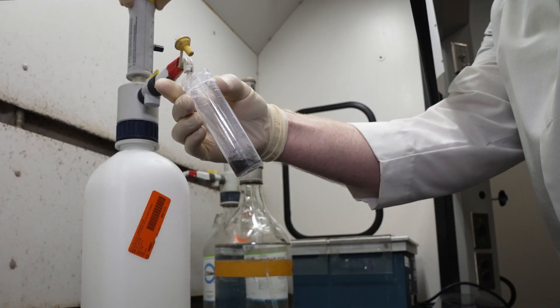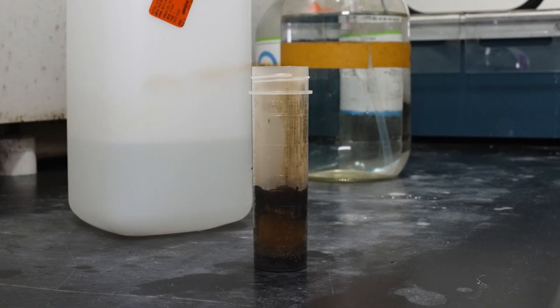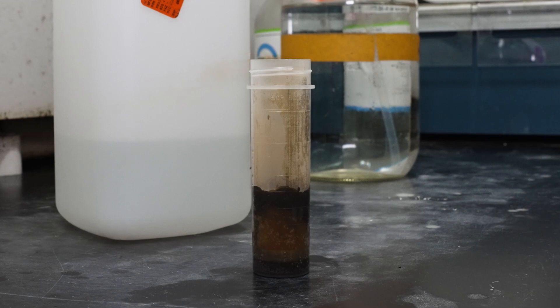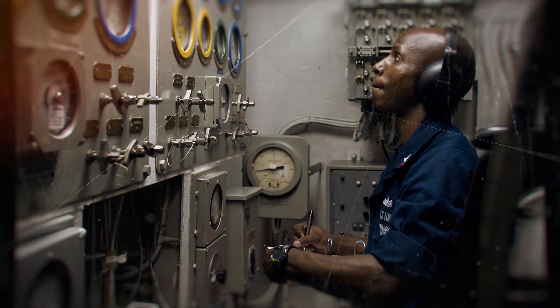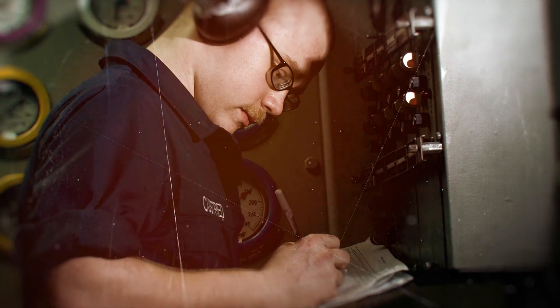Our radiochemists test the samples for dissolved and undissolved levels of metallic elements and radionuclides in the primary system. Naval reactor engineers then use that information to monitor the health and lifetime of each boat's core.